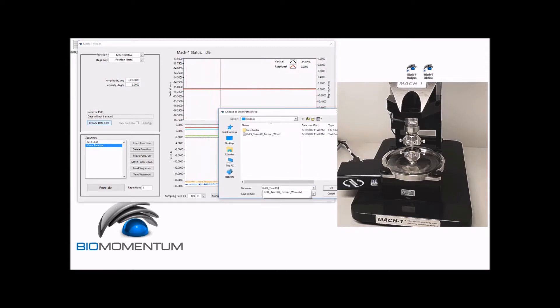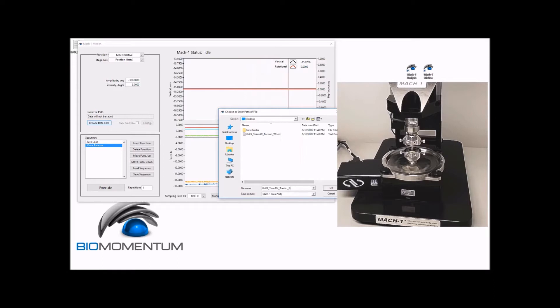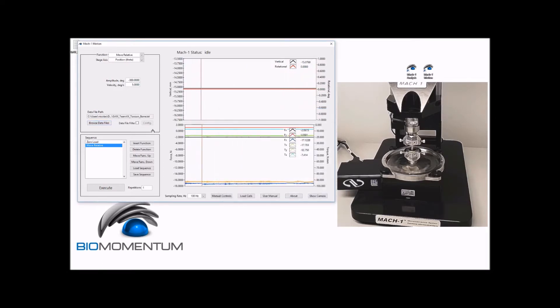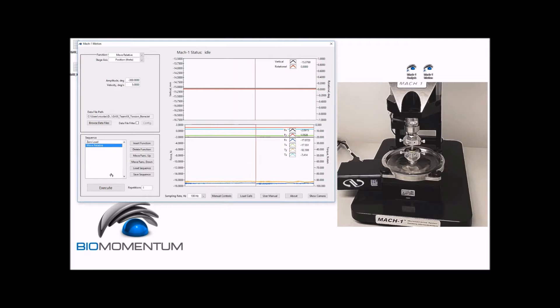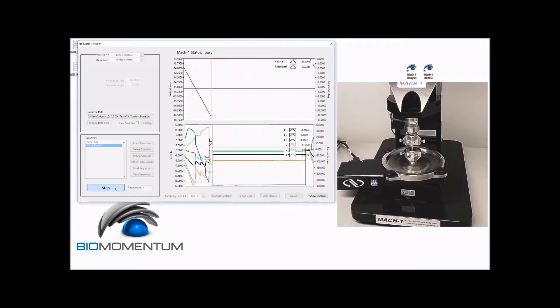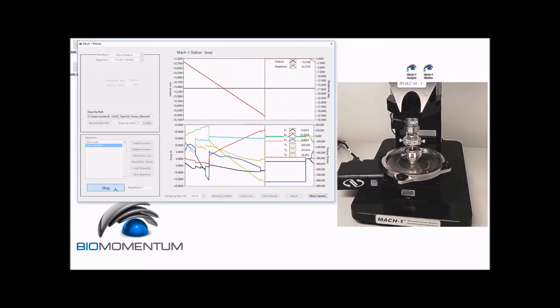We will save the data from the move relative function as group number underscore team number underscore torsion underscore bone. Note that a zero position function with position theta as a stage axis parameter can also be added between the zero load function and the move relative function. We can now execute the sequence.